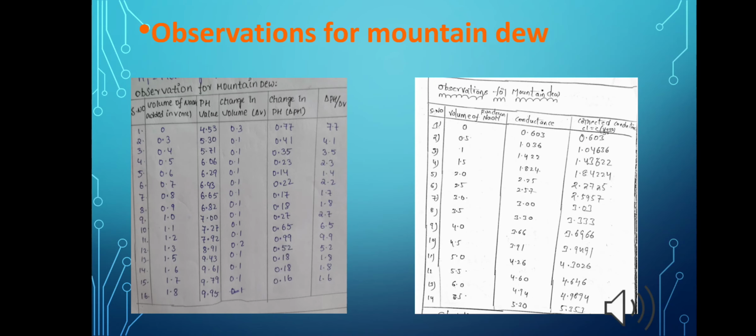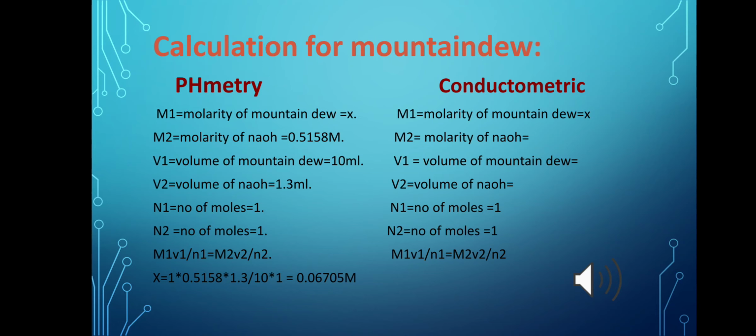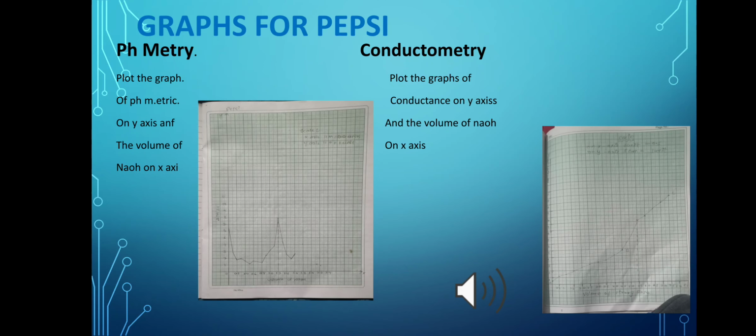Calculations for Mountain Dew. In the first picture, we will observe the calculation of molarity for Mountain Dew. Graphs. In the first graph, we will observe the pH metry for Pepsi.